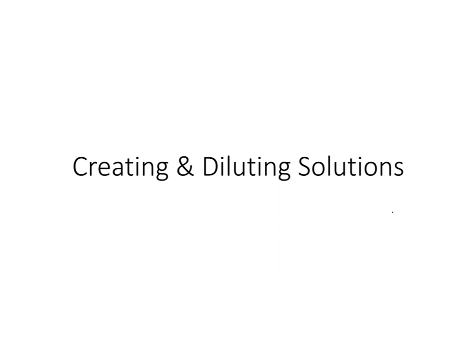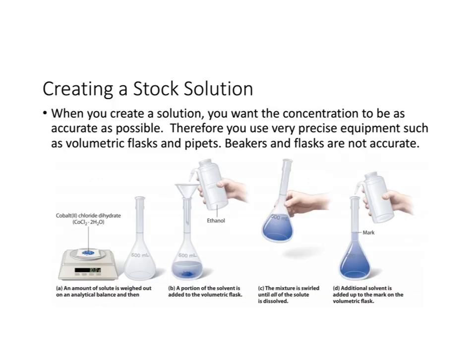Let's talk about how to determine the amount of solute we need to make a solution and how to make a stock solution, and then to dilute that stock solution into something of a desired concentration. First, let's talk about what a stock solution is.